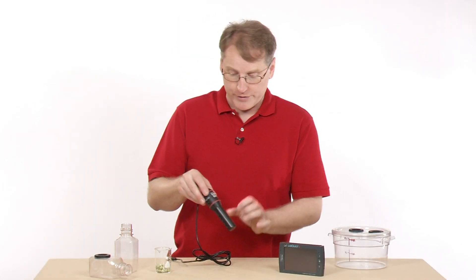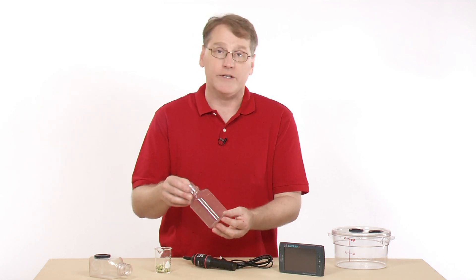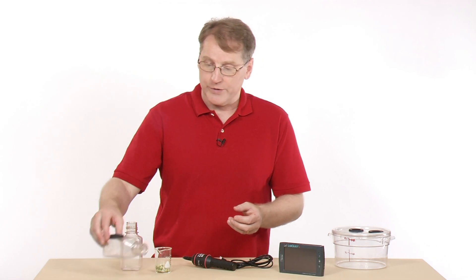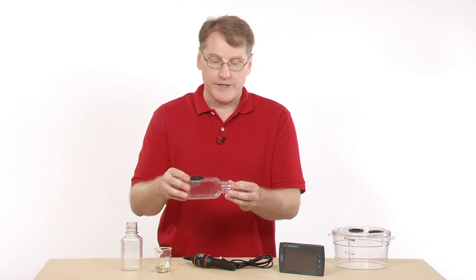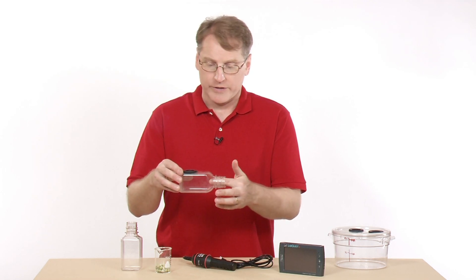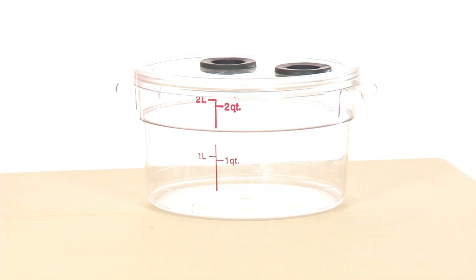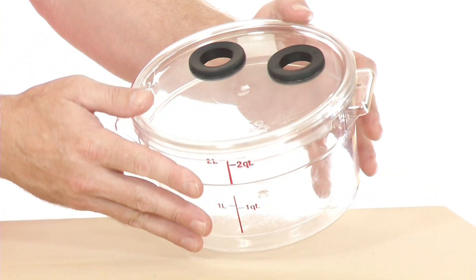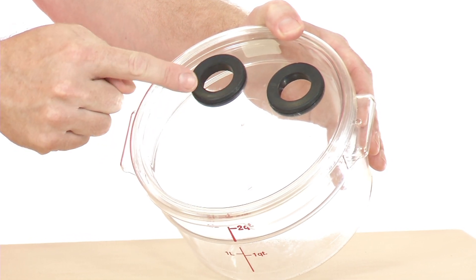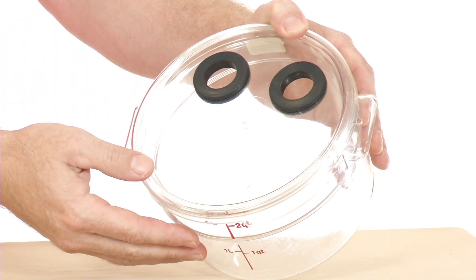To use this sensor, we suggest using it with several different chambers. There's the Nalgene bottle that comes with it. Another option is the BioChamber 250, which allows you to put more than one sensor in — for example, a CO2 and an oxygen sensor. There's also the BioChamber 2000, which has two holes and lets you put two sensors in a container simultaneously, such as a CO2 sensor and an oxygen sensor.